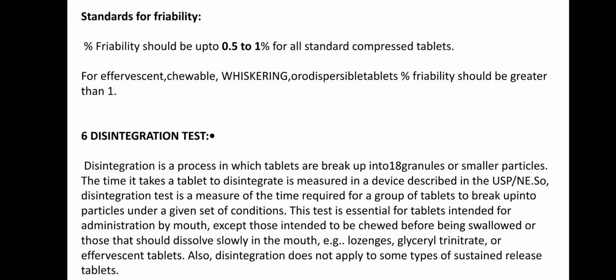This test is essential for tablets intended for administration by mouth, except those intended to be chewed before being swallowed or those that should dissolve slowly in the mouth. Examples: lozenges, glyceryl trinitrate, or effervescent tablets. Also, disintegration does not apply to some types of sustained release tablets.